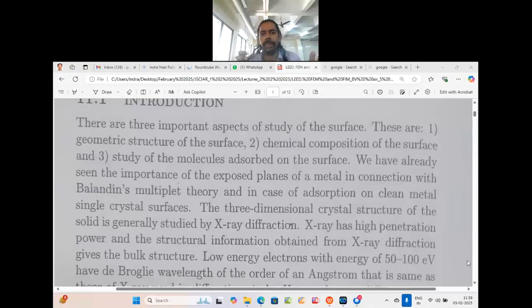X-rays are in, and X-rays are diffracted, and the diffracted X-rays are being probed. And the diffracted angle theta carries a wealth of information. That is what we see on the x-axis, 2 theta, and on the y-axis we see the intensity.